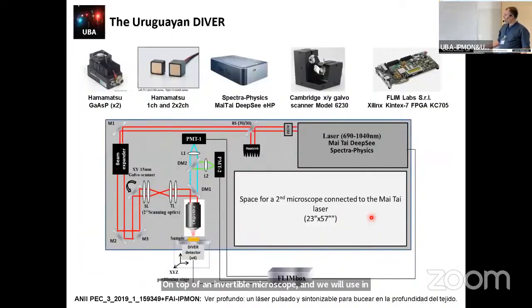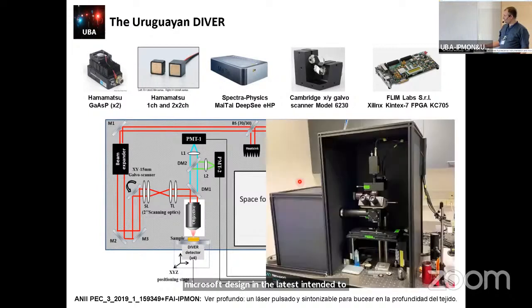And the other one is a DIVER microscope, which you will learn more about on Wednesday in the talk by Belén Torrado. This is a microscope designed in the LFD, intended to do imaging of highly scattering samples. And this is a picture of the DIVER at the Pasteur. So we will go there and we will learn more about this technology.